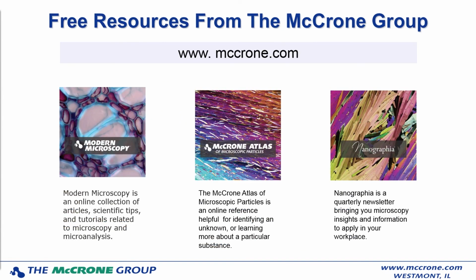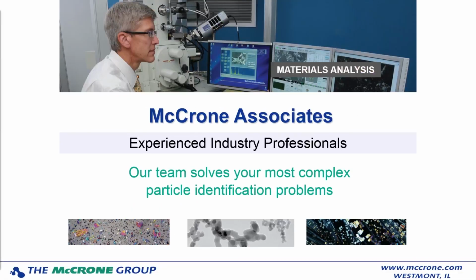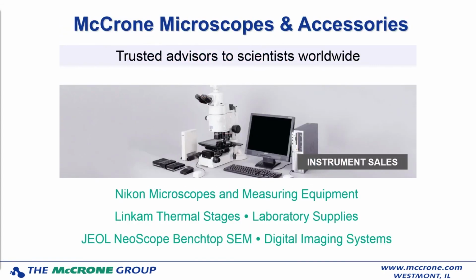There's another question. Sometimes the PXRD patterns of single crystals does not match with the simulated patterns from single crystals. What does it reflect? Is it polymorphs? Possibly polymorphs, and this is something when you're talking about single crystal patterns, if you're talking about determining crystal structures, again, the indexing is something we don't do at McCrone. We concentrate mostly on identifying powder samples instead of single crystals. But if the simulated pattern doesn't match, I mean, it would depend on the material. So I'm not sure how to address that.